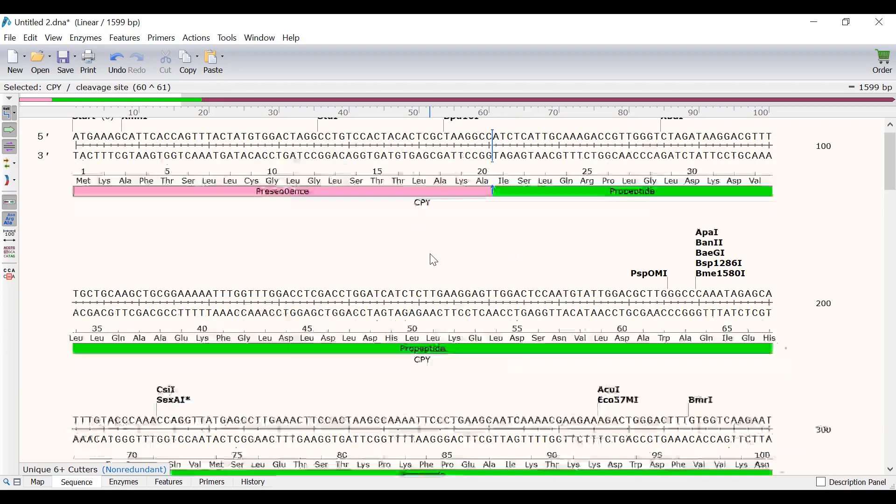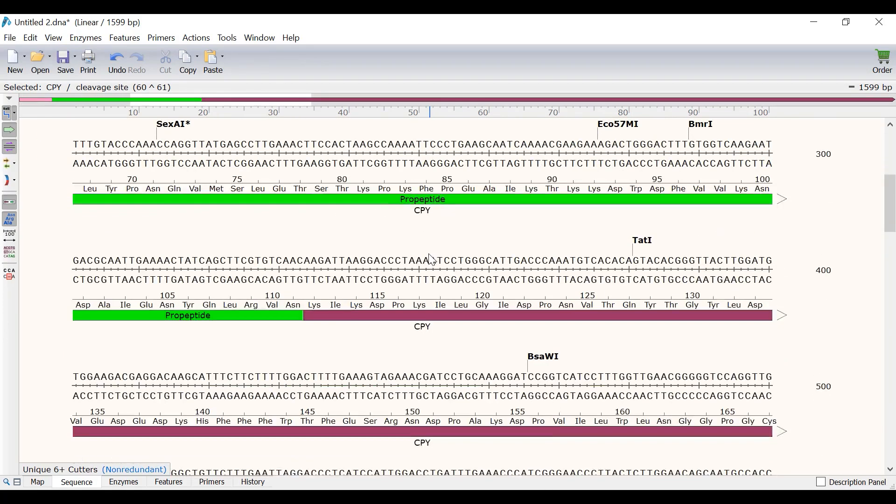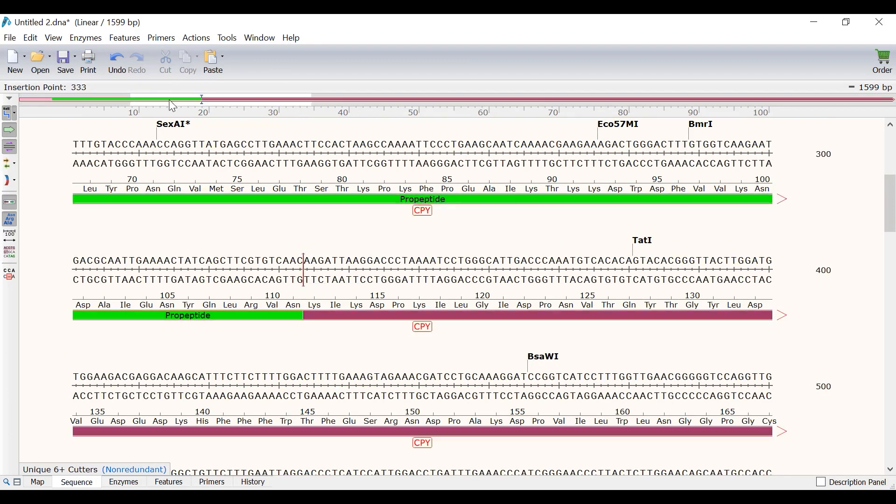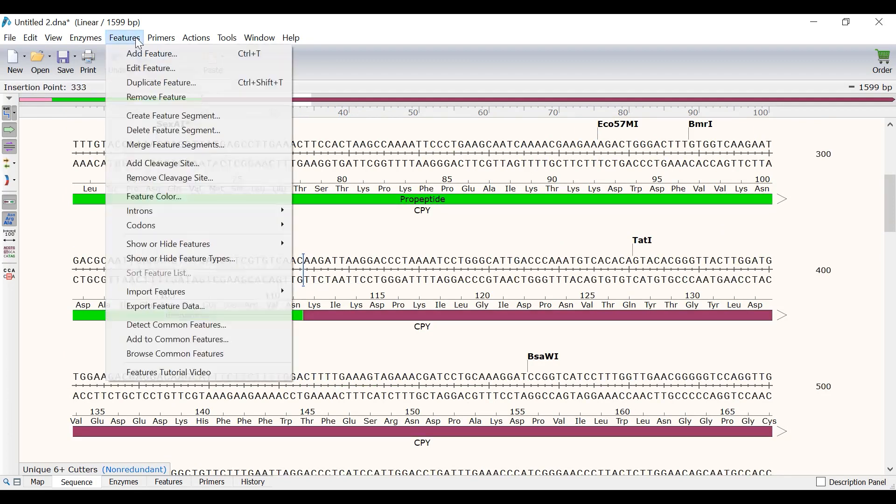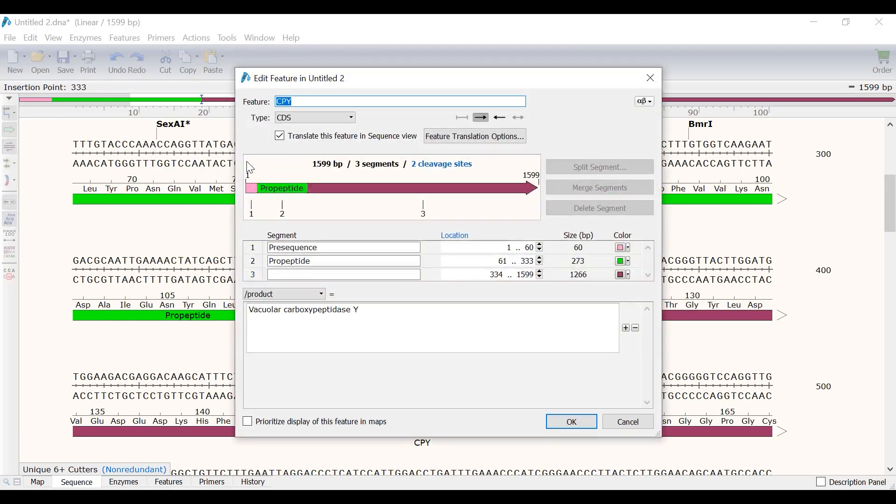So I will click on the region immediately after amino acid 111. Then go to Features, Add Cleavage Site and then click OK in the new window.